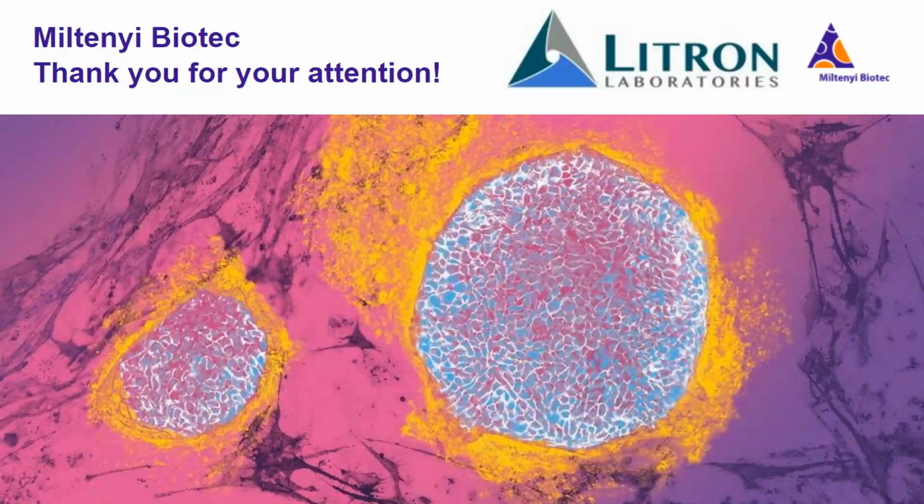That way, if it comes up that you needed to look at a mutation endpoint later on, you don't have to start a whole other dedicated study and invest all the time and resources to do that again. You simply dip into the freezer where you froze those samples away, and you can get that mutation endpoint. So there are several characteristics of this assay that really drive it home towards that 28-day toxicology study. In fact, that was really the study design that we used for the development of the assay. The bulk of the data that are out there and that you'll read in the literature were based on 28-day toxicology studies. So it really is well established for that paradigm.